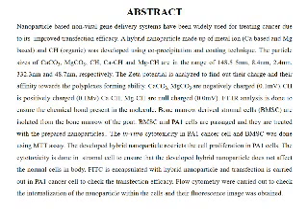FITC is encapsulated with hybrid nanoparticle, and transfection is carried out in PA1 cells to check its transfection efficiency. Flow cytometer is used to see the internalization of the nanoparticle within the cell, and the fluorescence image was obtained.